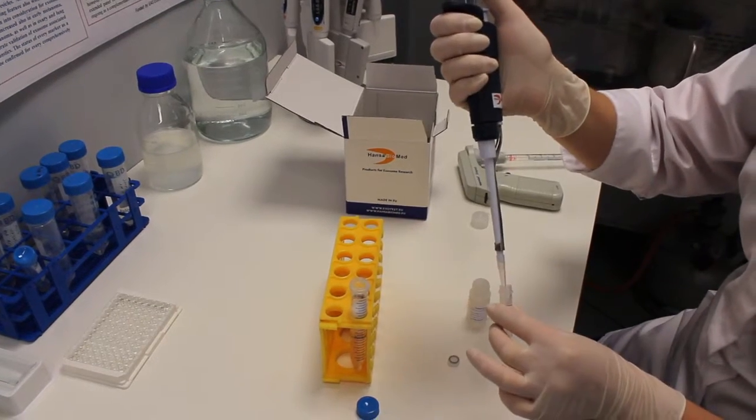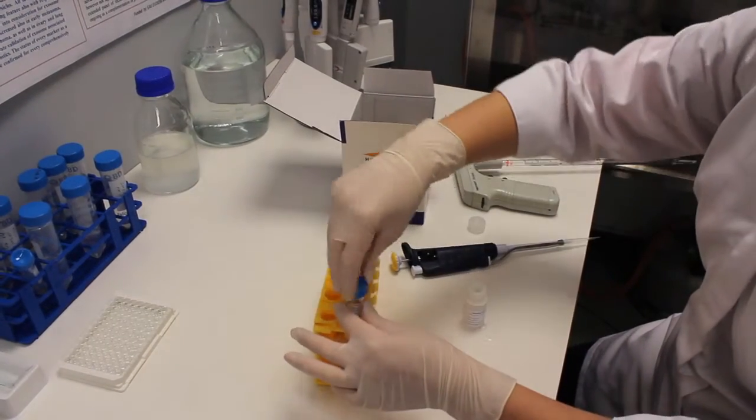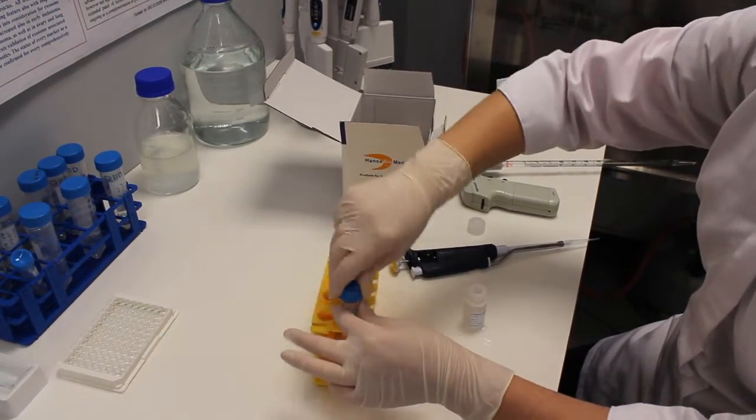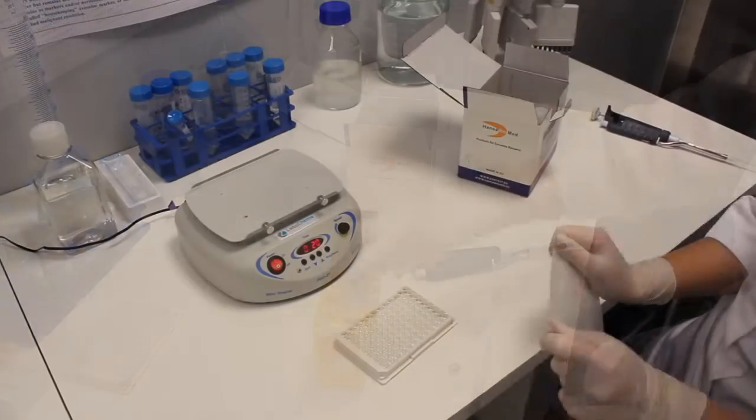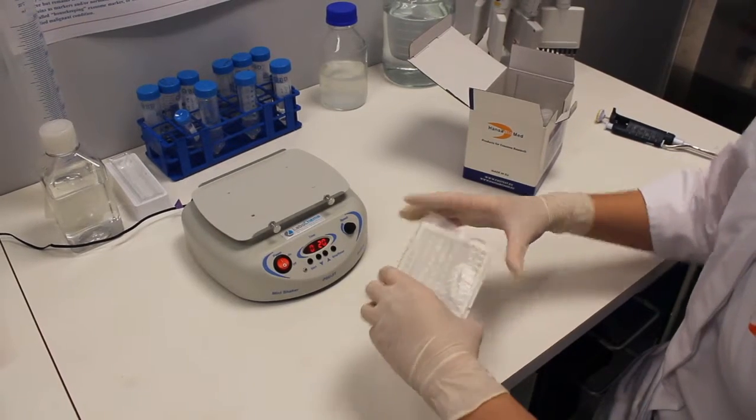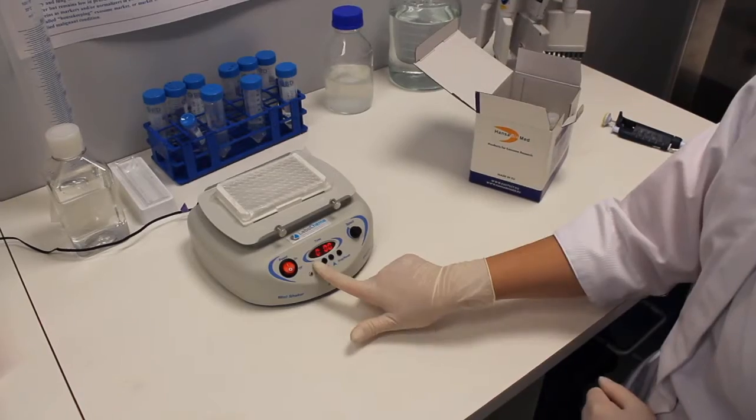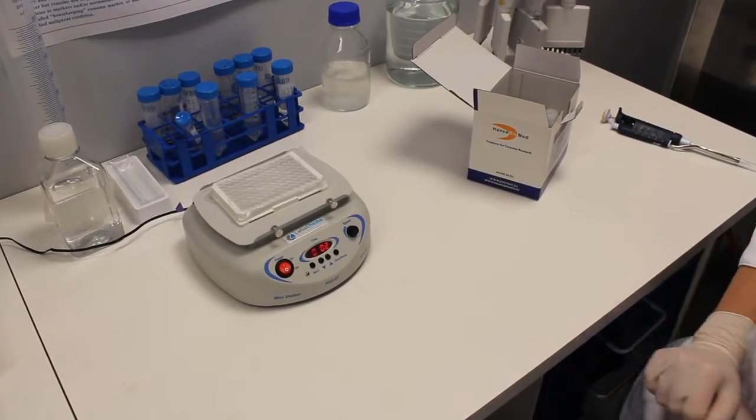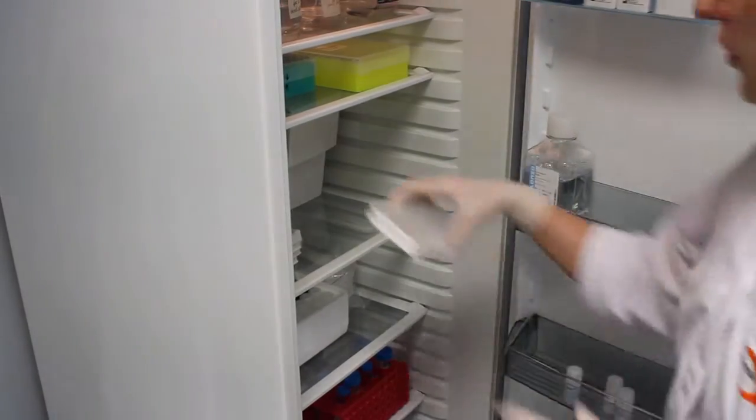Add 100 microliters of diluted primary antibody per well. Seal the plate with parafilm and incubate at room temperature while shaking for 20 minutes. Then incubate at plus 4 degrees for 2 hours.